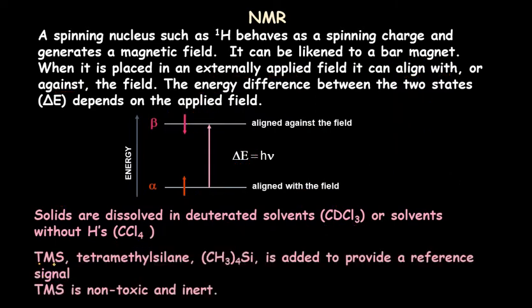Now what is TMS? TMS is tetramethylsilane. Now what is this? This is added to provide a reference signal for our compound.